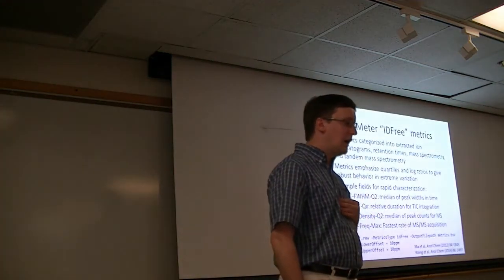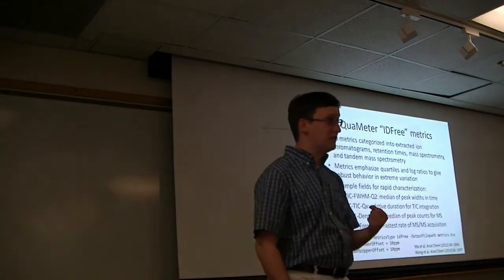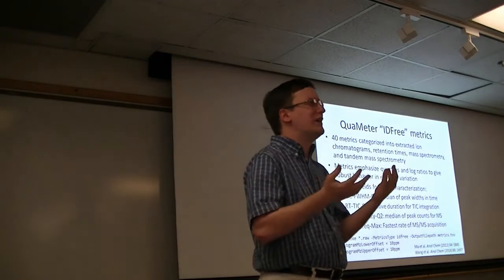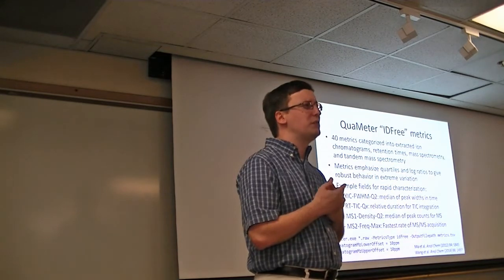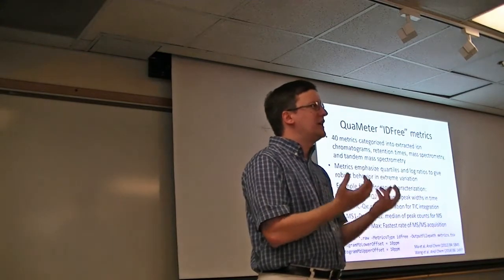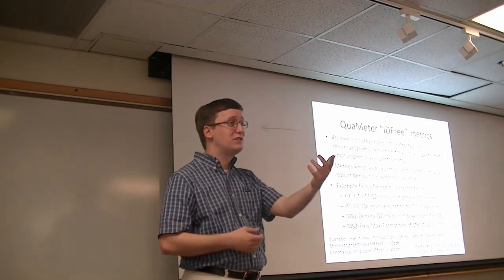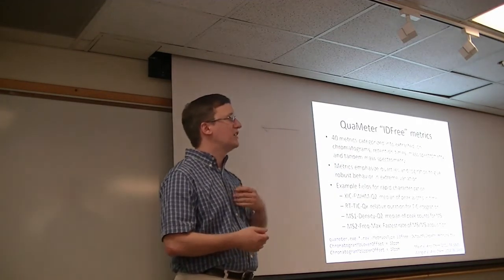More formally, our lab has been very invested in the effort to produce good quality metrics from files. The goal here is not necessarily to produce a low-level number, such as the number of scans, though things like that are included within our metrics. The goal is to produce characteristics of the files that enable us to make decisions downstream. That is a tough combination to make. We want metrics that are sensible to the scientists who are operating the instruments, but that are also useful in long-term instrument monitoring.